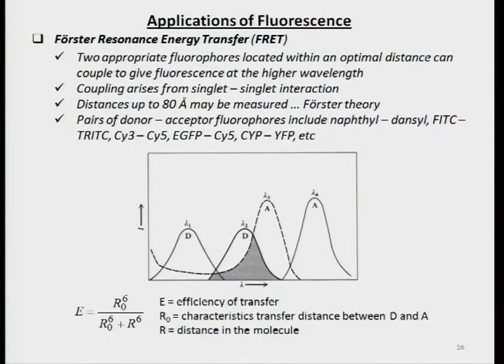Okay, another way in which fluorescence can be utilized is FRET. FRET actually stands for Förster Resonance Energy Transfer. It doesn't really stand for fluorescence resonance energy transfer. Most people think of it as fluorescence, but this is not really a fluorescence thing. Yes, there are fluorophores that are involved.